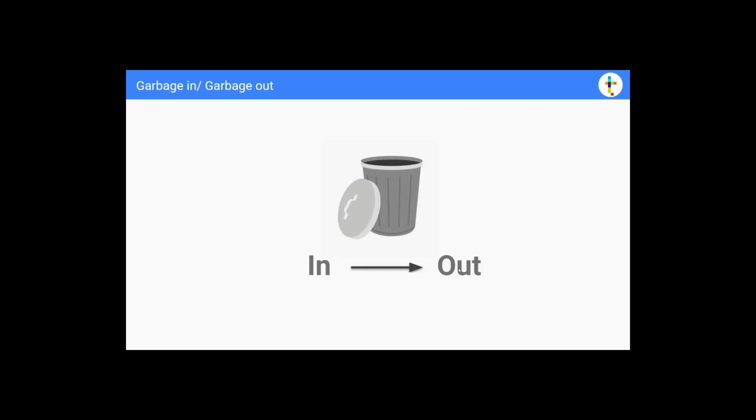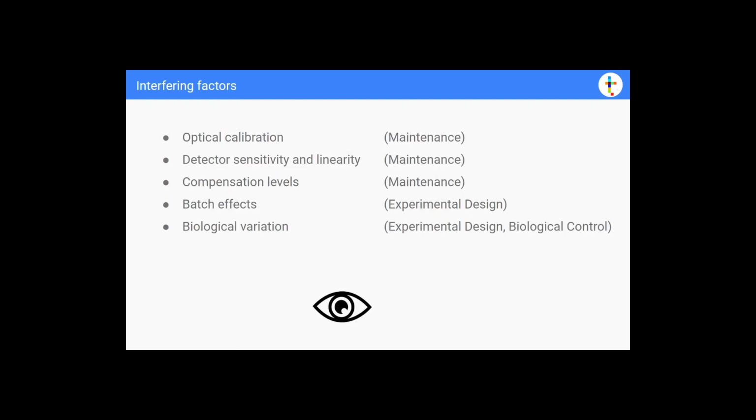So it's not additive, in that if there's trouble, it's an exponential consequence for the data, the amount of time you spend on data analysis. However, you can rescue your data using techniques that I will talk about.